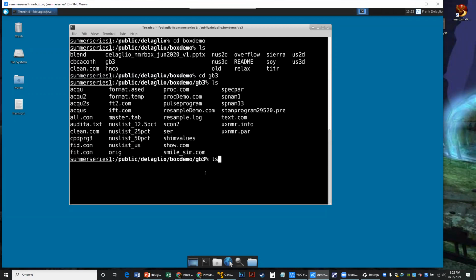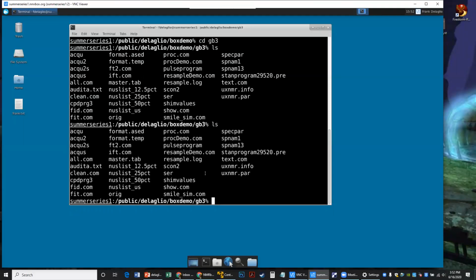This is data that was measured on a Bruker spectrometer. So before we get into too many details, we're going to talk in tedious detail about the procedure for converting data from the spectrometer format to the NMRPipe format, because there are a few details of this that if you get them right early on, when you first work with the data, things will be much easier downstream when you have multiple spectra to work with.